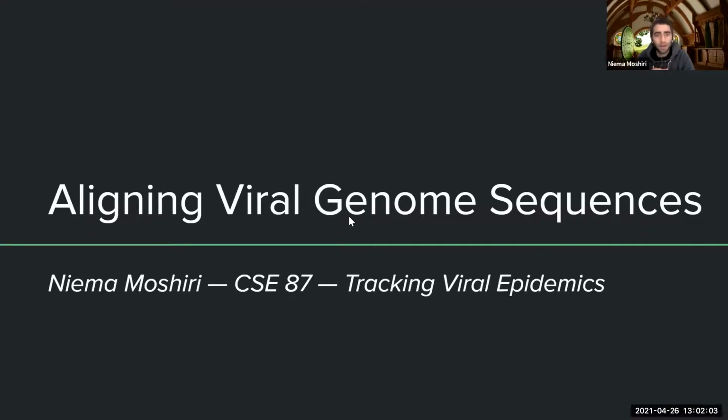So hey everybody. So far we've talked about basically how we generate the raw sequence data. We talked about how we go from a single sample's sequence data to a genome, right? We talked about de novo genome assembly. And then more recently, in the midst of the pandemic, we talked about align to reference and then pile up.